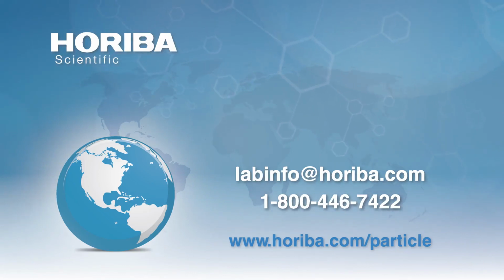It's interesting that the zeta potential is an average over the size of the particle, and very often you'll find that, as long as there are no massive aggregates, the zeta potential of a 25 and a 50 nanometer particle might not vary all that much. The problem is keeping the particles apart while you're making a measurement.